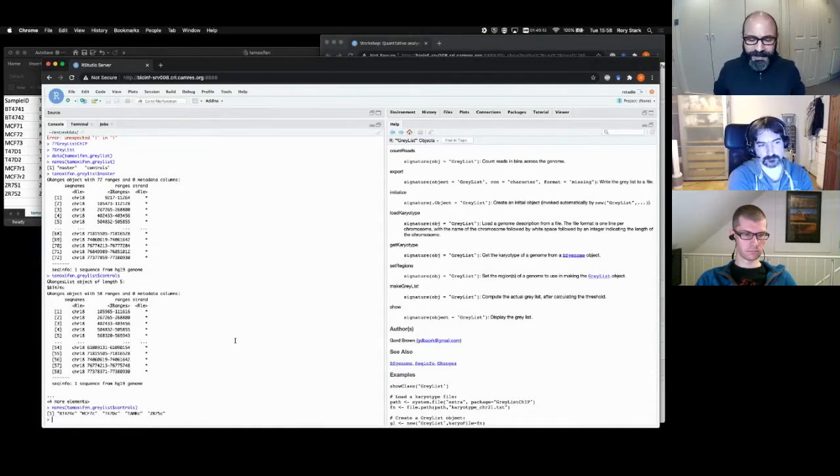Technically, it would be better practice to compute the gray lists and then filter the reads, the alignments, before you call peaks. Because something like MACS builds a model of the background, and it's building a model with these anomalous regions. And if you remove the anomalous regions, you'll actually get a slightly different set of peaks. So you can go back and recall peaks. That would be ideal, but we found that pretty much you can eliminate them at this point.